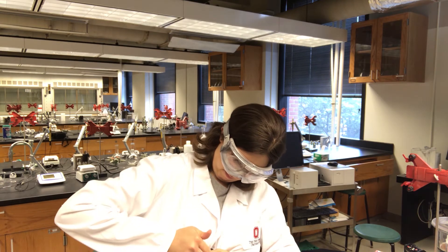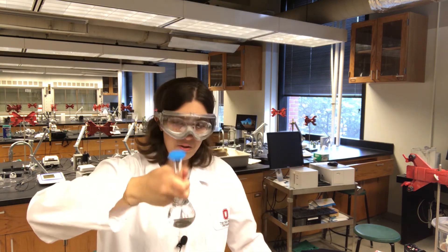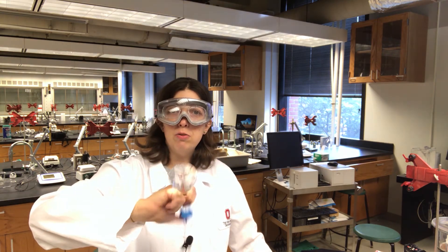Alright, here I go again — I did it. So now I've got my most concentrated solution, and from this I'm going to do serial dilutions.